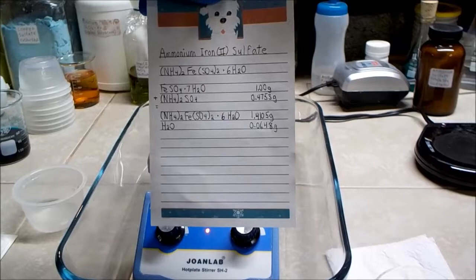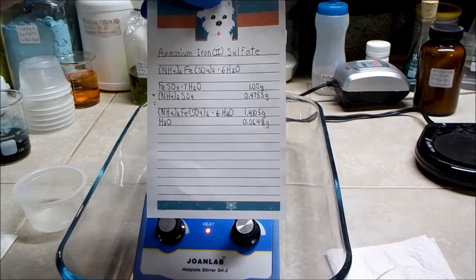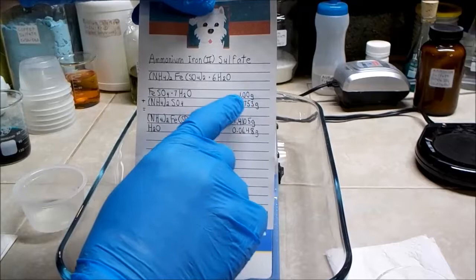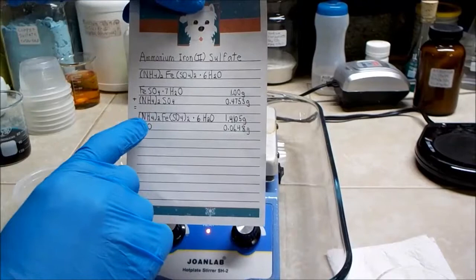If you want to do this yourself, here's the amounts scaled down to 1 gram. So iron sulfate, if 1 gram of the heptahydrate is used, you need 0.4753 grams of the ammonium sulfate. So with that, you can scale it to whatever amount you need.